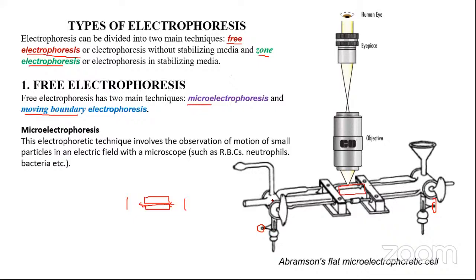But electrodes are allowed to get inside. Bhavika is asking why the electrode placement is like that, it is not clear. This is a very old arrangement, and is actually used for separation of certain cellular components. And why it is used for that, I will delve upon. But basically, the electrodes go inside this assembly just like this. The electrode is like this, so that you can connect it to a power supply outside the cell, and the electrodes get into the buffer here, and in between these two electrodes, this entire area is connected by means of the channel that is created by buffer. Is this much clear?